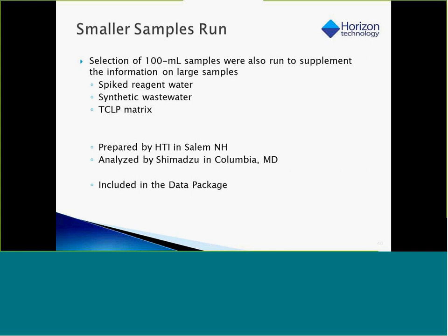A selection of 100 ml samples were also run to supplement the information on large samples. We ran spiked reagent water, synthetic wastewater, and a TCLP matrix. They were prepared in Salem, New Hampshire, in our laboratory, and then analyzed by Shimadzu in Maryland, and that was included in the data package as well.